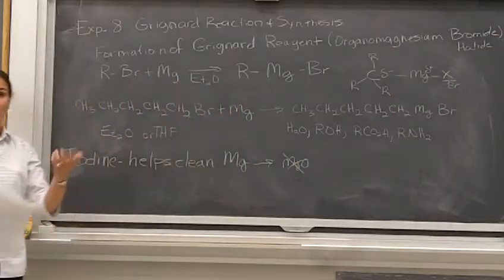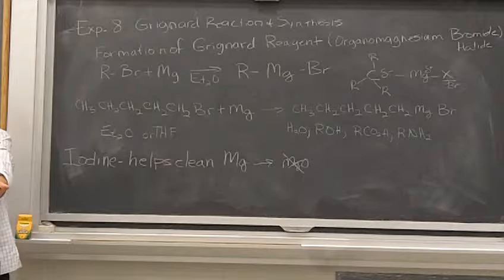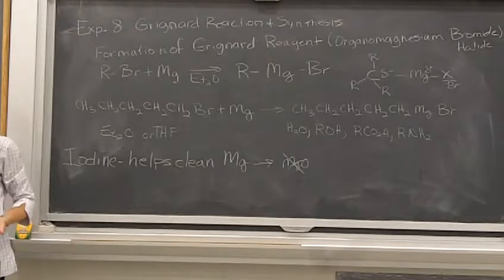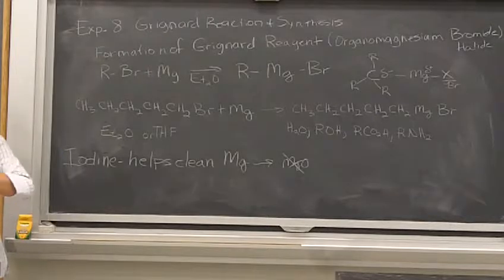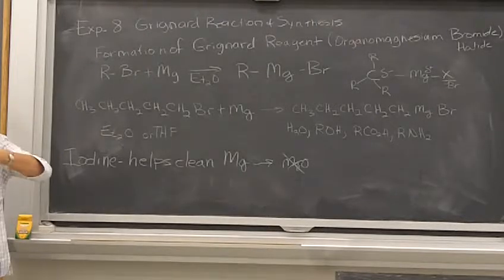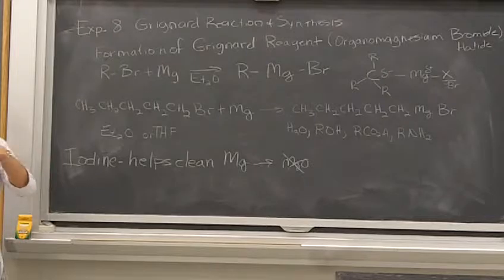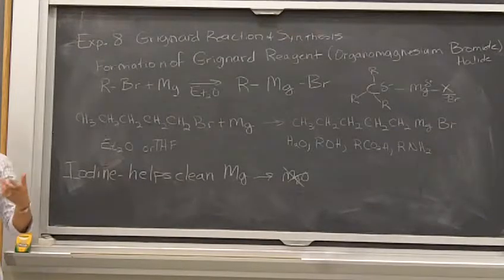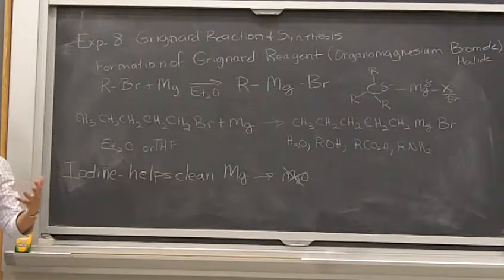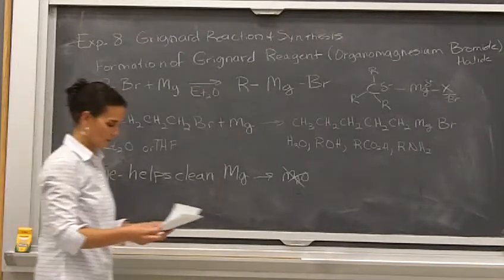So when you weigh out your magnesium, don't let it sit in the air for a long time. Weigh out your magnesium right before you want to put it into your reaction, okay? When you are done weighing it out, cap the magnesium right away so it's not sitting there getting more air on it and oxidizing more before the next person uses it, okay? This is a lab that you've got to be really careful, keep everything capped except for when you're using it. Otherwise, all the reagents need to stay capped because we don't want water, we don't want air reacting with the reagents.